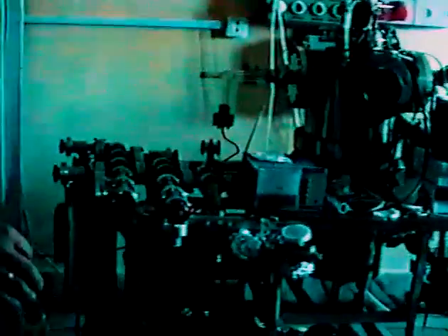First, may I introduce my colleague Gábor Krivényi. How are you? Well, in this lab we have two UHV apparatus. First is, may I call it a traditional one, a UHV chamber equipped with different facilities for doing Auger and so-called surface science modern techniques.